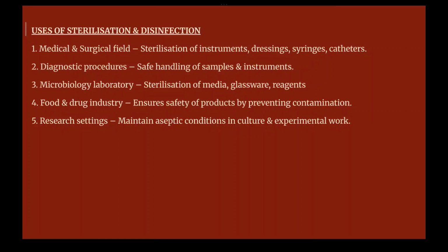Now, in microbiology laboratories, certain media require sterilization, like glassware and reagents. These are required to grow a single type of microorganism. Sterilization is essential to prevent the microorganisms that are in the air from entering into the media. So sterilization is essential in the microbiology laboratory.